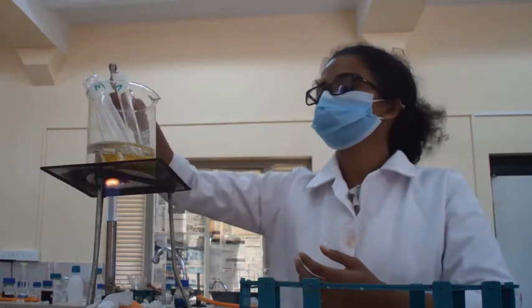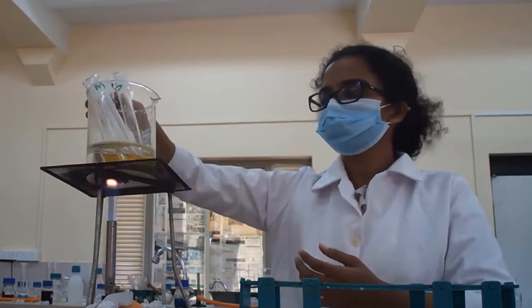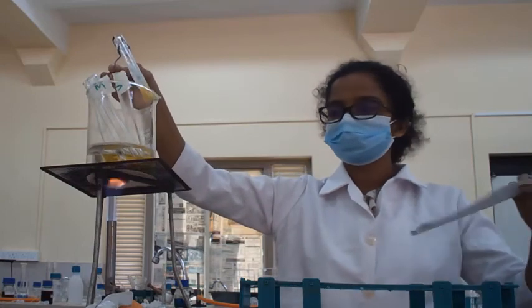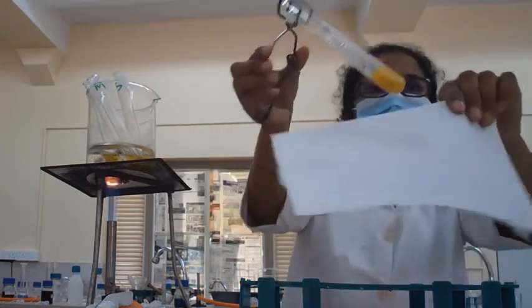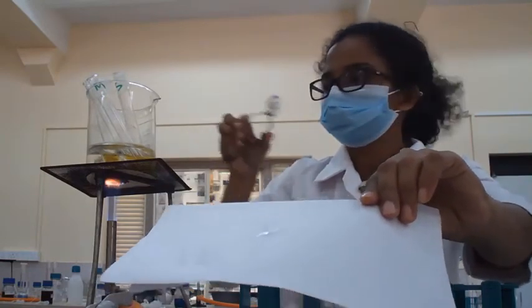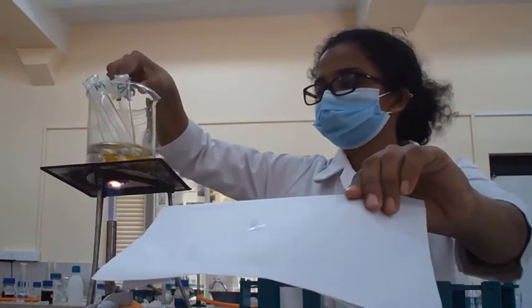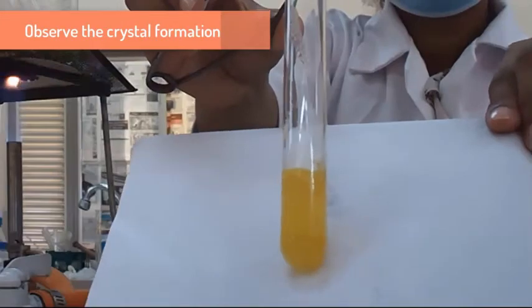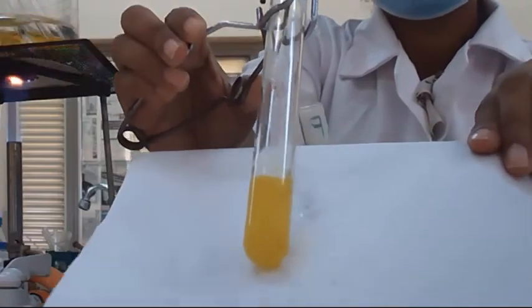Now we are going to take these test tubes out of the water bath. I think you could see that some crystals have been formed. See here, you could see some crystals have been formed.